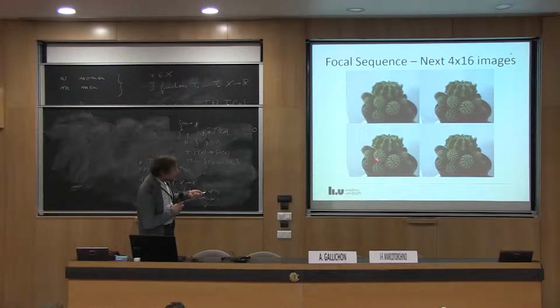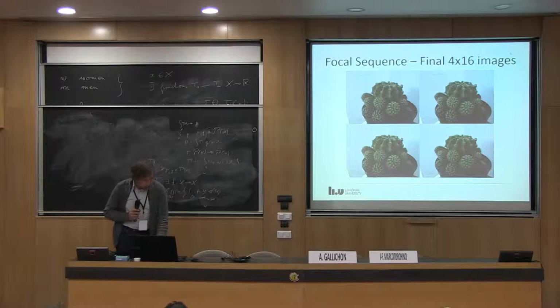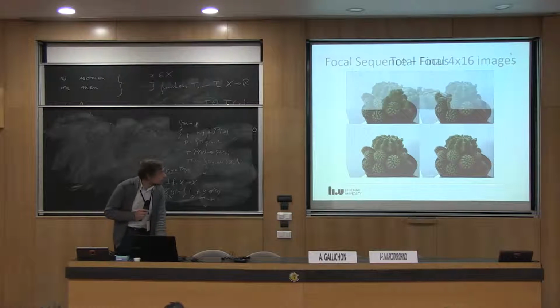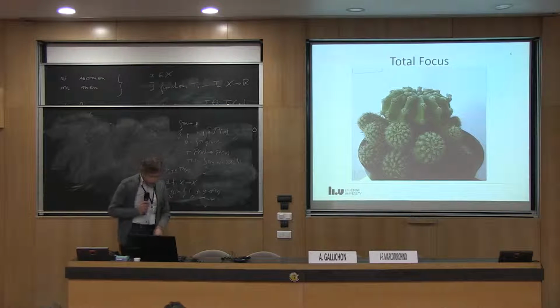And now if you focus on this area here, you see that this becomes sharp. So we take the next one here, and then this one here is sharp, and then it becomes blurred again. And you see in the background here on the wall, a picture frame is coming up. So, no problem. Everybody can do this. And if you do this patchwise, you can produce an image where everything is in focus.